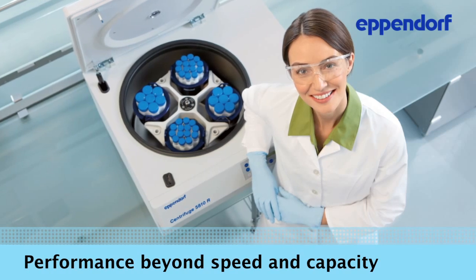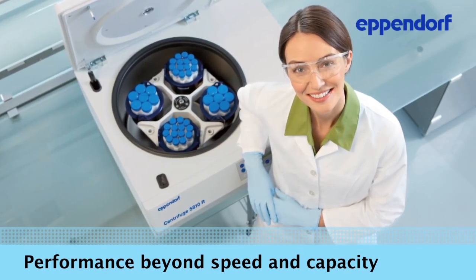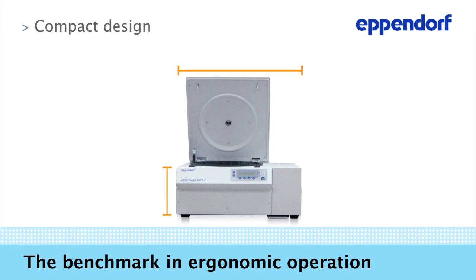Speed and capacity are not all these centrifuges have to offer. They go even further and offer you unique features to make everyday lab routines faster and easier. For example, we gave our centrifuges a very compact design — the Centrifuge 5810R is the most compact 3.0L model currently on the market.